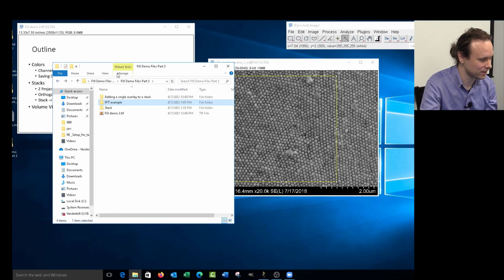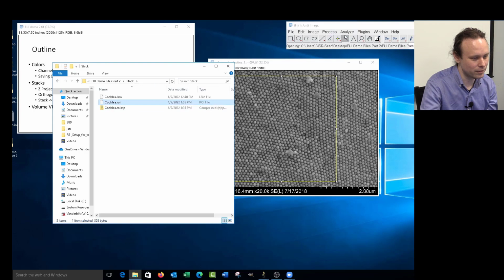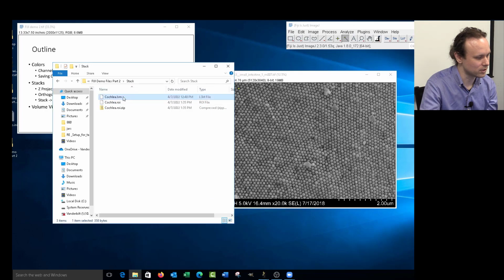That's a good question, and something we actually do fairly frequently. I don't have a great example image for that. I'm just going to open our cochlea image again. That's a good point.